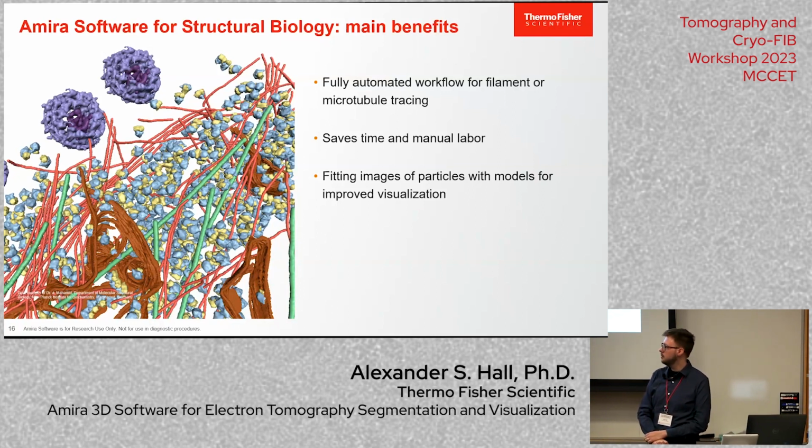Right now, in my experience, it's more efficient to train your own model in this way, and that's why I show off that tool. I have tried to use other people's pre-trained models on data that weren't like their demonstration data, and sometimes I'm not very satisfied with the results. So I like to have the ability to train my own model.